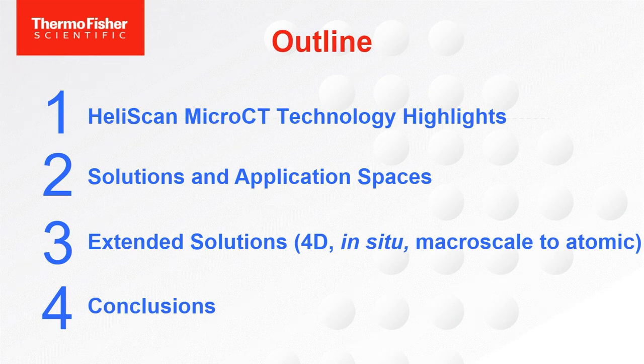I would like to continue talking about non-invasive 3D X-ray MicroCT. And I'd like to focus a little bit on some of the technology highlights that the HeliScan can bring to all the examples that Robert gave from CMOS, which is definitely a world-class facility for imaging. And I really appreciated his super impressive results that he just went through, and I'll go through a couple more, as well as talking about some of the extended solutions that you can do with a HeliScan MicroCT with 4D and in situ experiments, and then we will conclude for today.